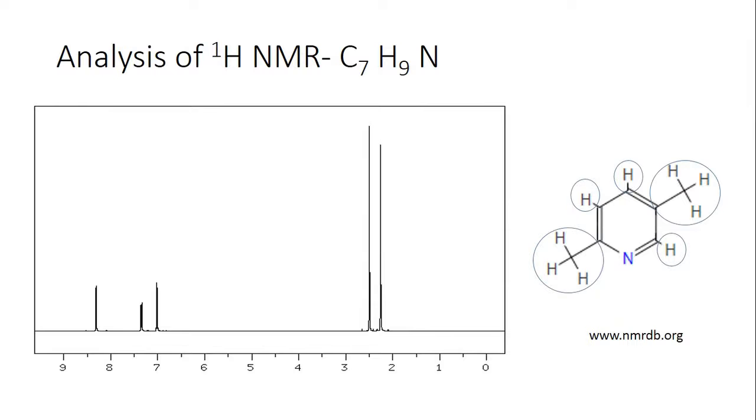So next, proton NMR is a little more complex, but it does look similar. And the easiest way to differentiate which you're working with is to refer to the x-axis. And it's again in parts per million, but it only ranges from 9 to 0 instead of 200 to 0. So again, electronegative atoms will cause a downfield shift.